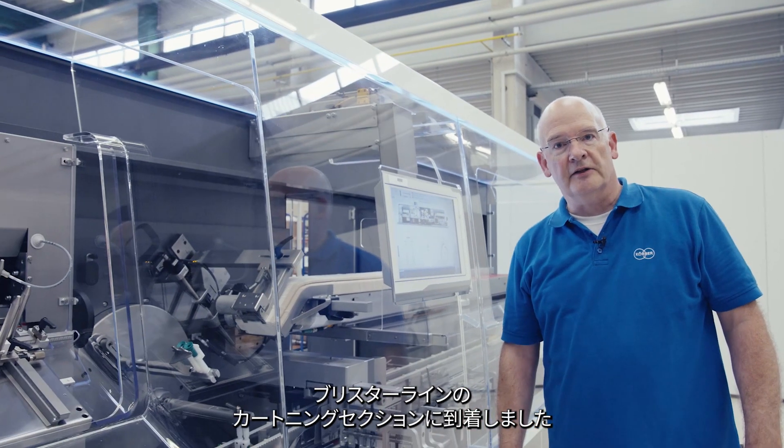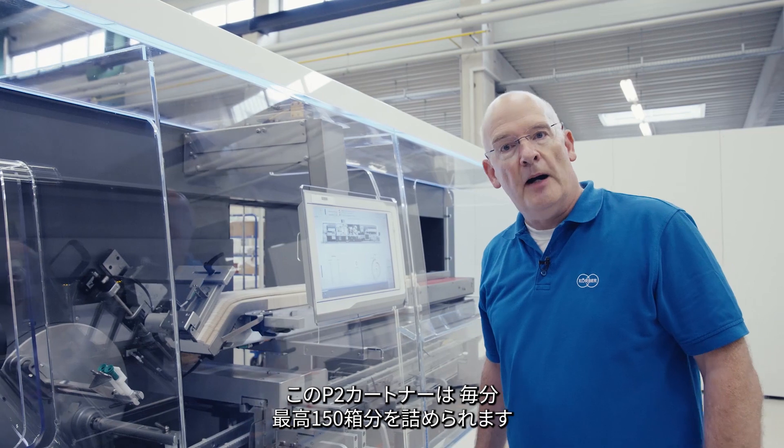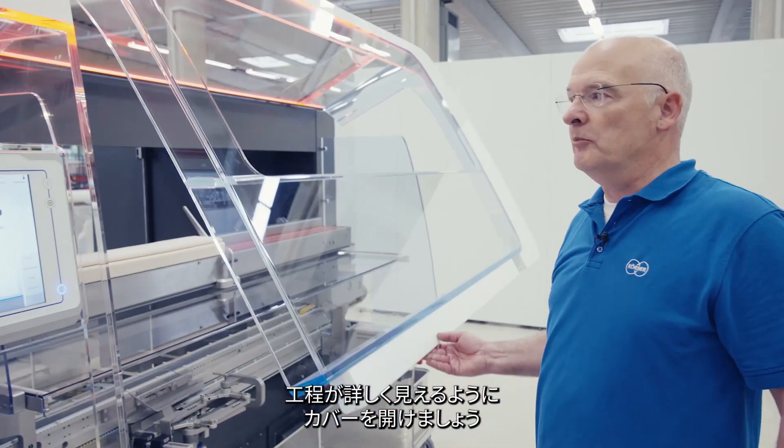We have now arrived at the cartoning section of our blister line. This is a P2 cartoner designed for up to 150 cartons per minute. Let me open the covers so we can see the process in more detail.